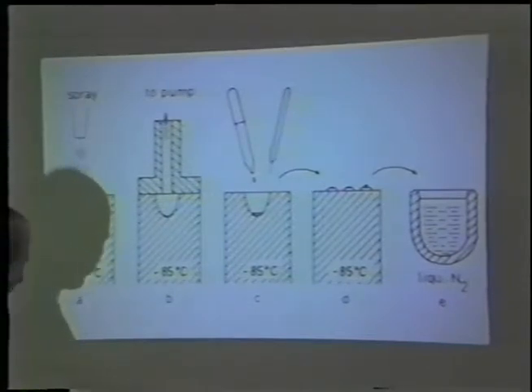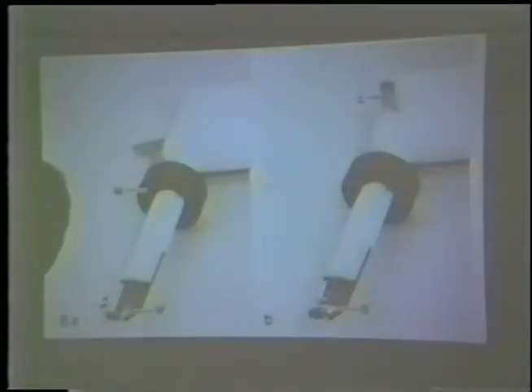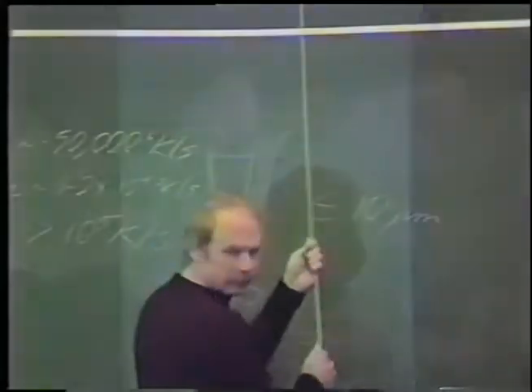Okay. Let's see what the next slide is. These are somewhat out of sequence. Let me raise this for a moment. Put it back down. We turn off the light.